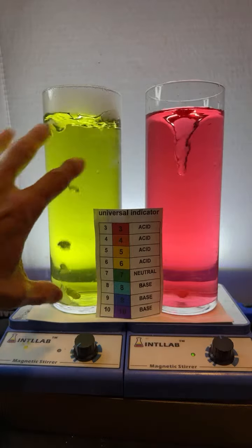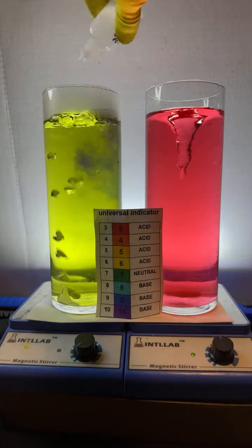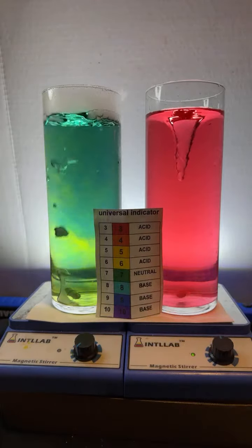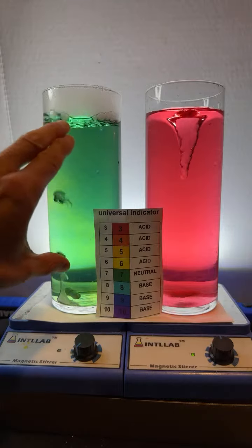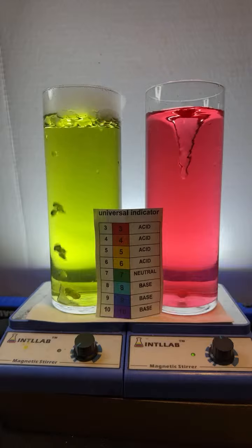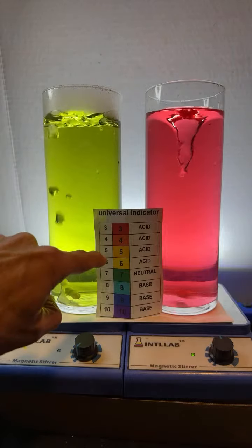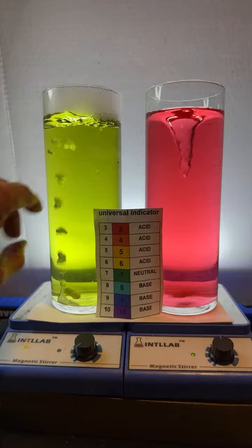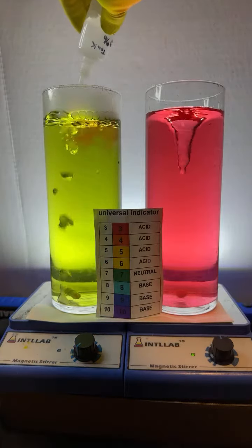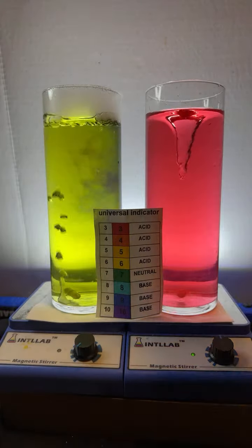That's because the carbonic acid has reacted with a lot of the base that I have been adding, and that's going to form a carbonate-bicarbonate buffer system, and that's going to keep our pH really close to pH 6. It actually might be bicarbonate carbon dioxide. I think that's probably more likely. It's a carbon dioxide bicarbonate buffered system. And so adding acid or base to this over here is not going to change the pH a whole lot.